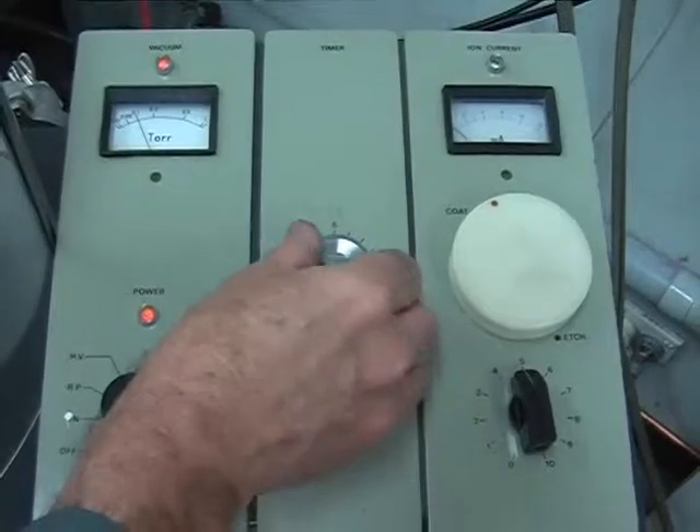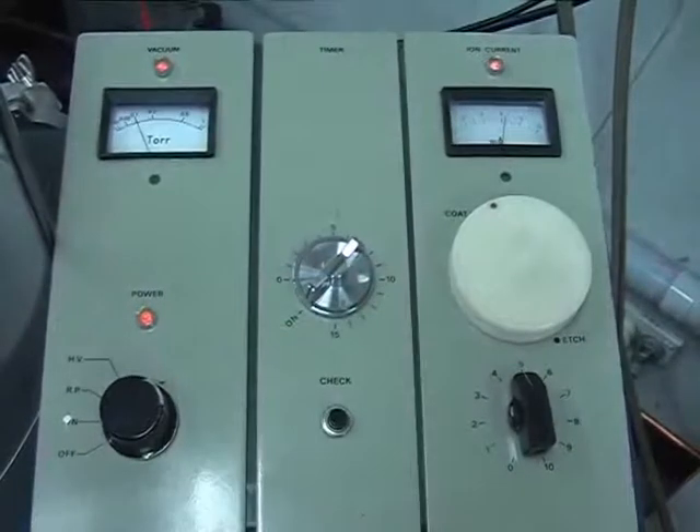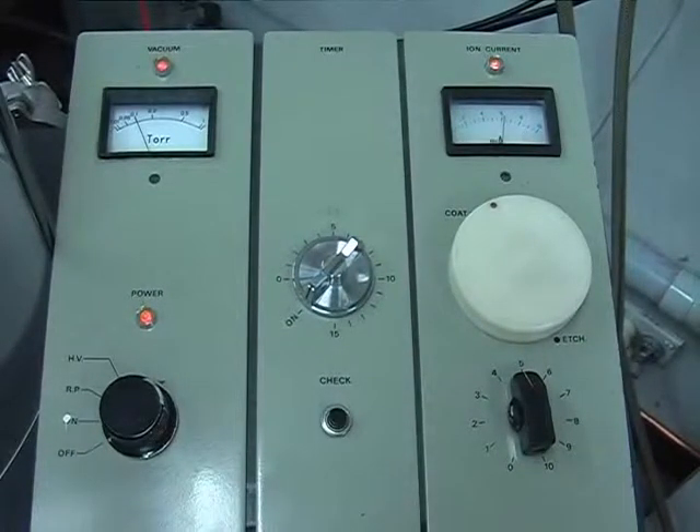Turn the timer to on and use the wall clock to time the length of coating. Do not use the timer on the coater. During coating, monitor and readjust the argon pressure in the chamber with the argon pressure control needle valve to ensure the ion current remains at 6 milliamps.